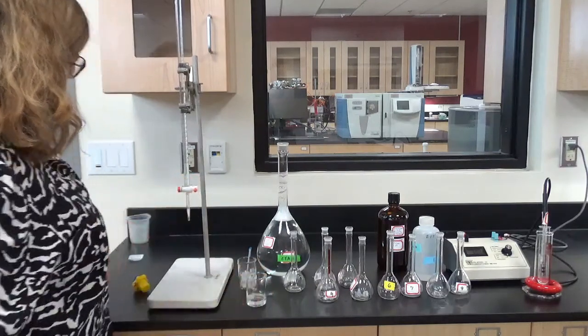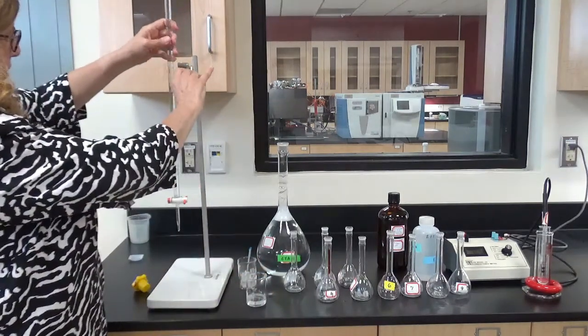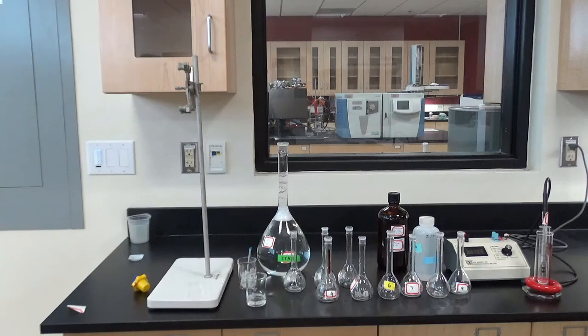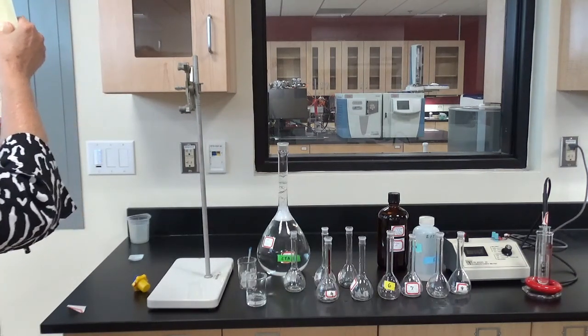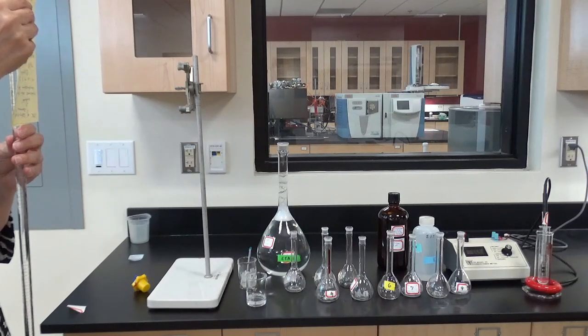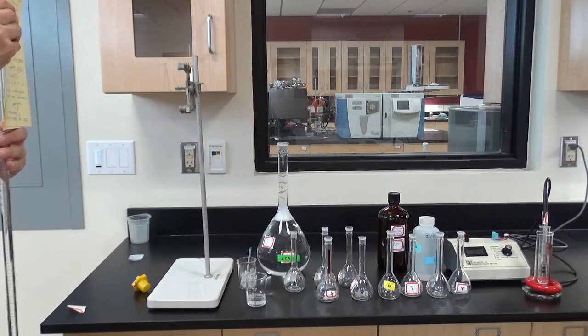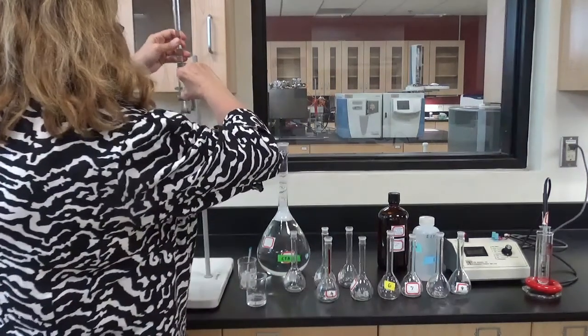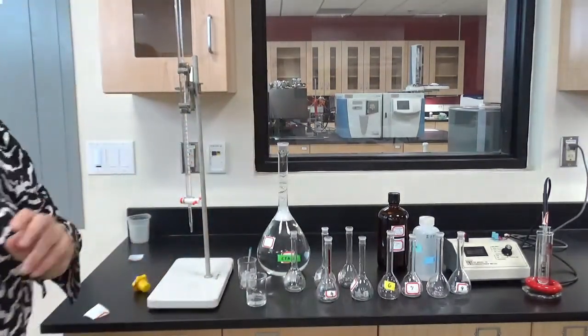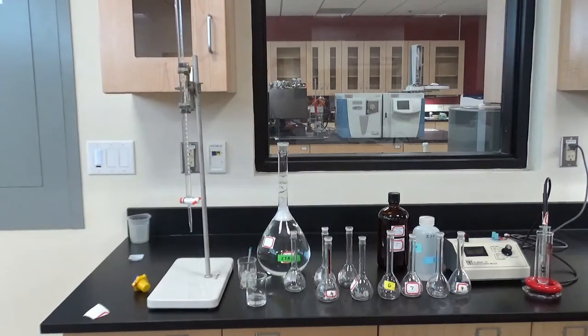Okay, and let me get that reading of the first. So it looks to me like 1.28 milliliters will be my initial reading. Write that down on the data sheet here.